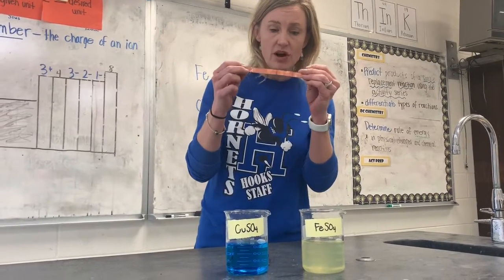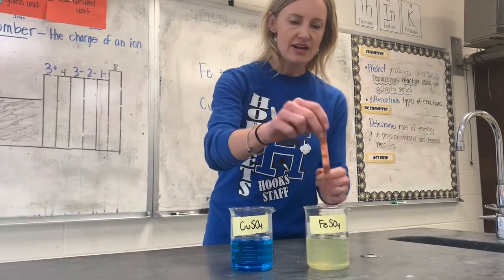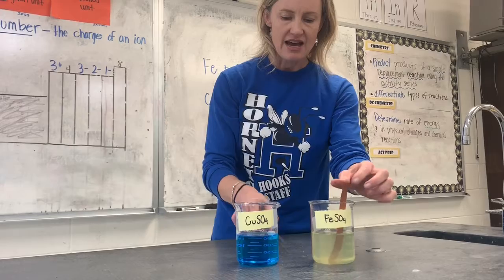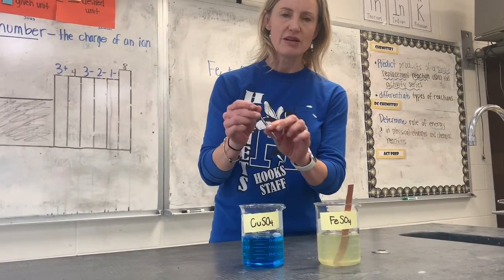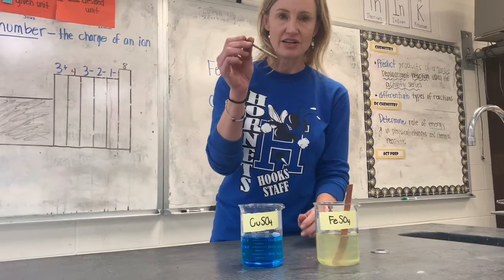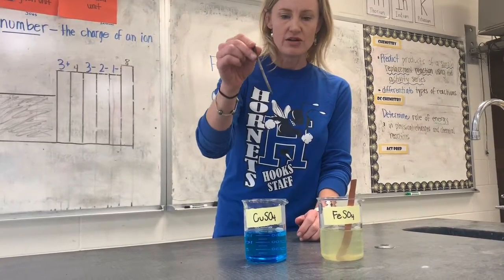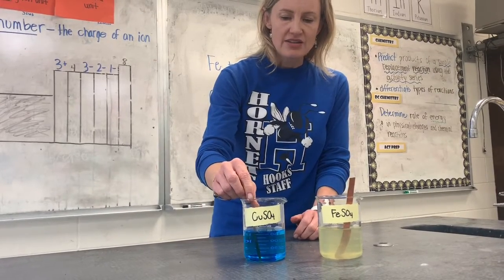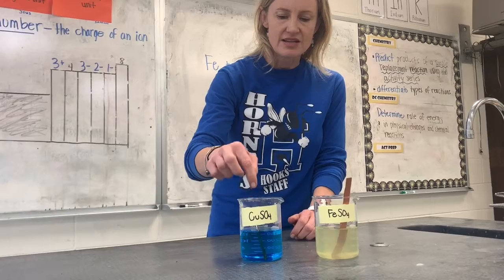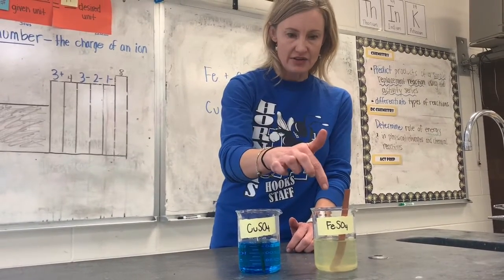Okay, so what I'm going to do is I have a piece of copper. This is elemental copper, and I'm going to stick this copper in the iron sulfate, and I have an iron nail. It was kind of rusty and dirty, but I tried to clean it off. I definitely have some shiny iron exposed on there. I'm going to stick this nail, which is iron, into the copper sulfate.